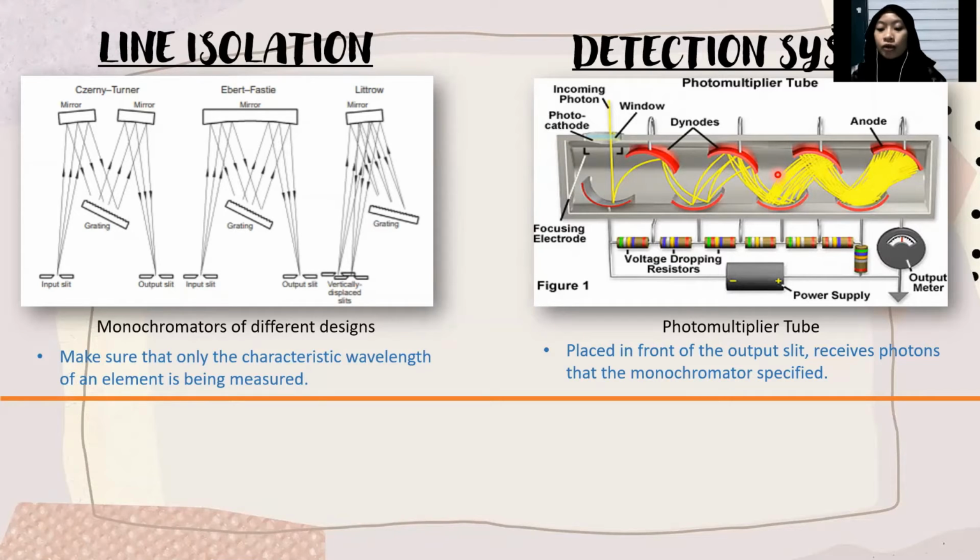So now I will briefly explain the workings of the PMT. It gains light through the window which encloses the photocathode that will emit electrons. As the electrons are emitted, they will be accelerated toward the dynode and amplified successively. As can be seen here, the electrons are amplified as they move from one dynode to another. The electrons will then be collected as current and converted to voltage to be measured.